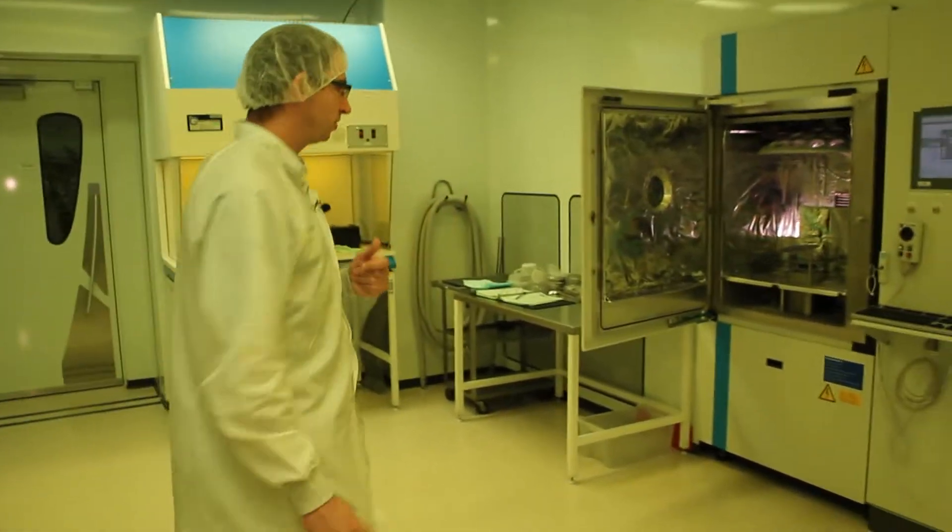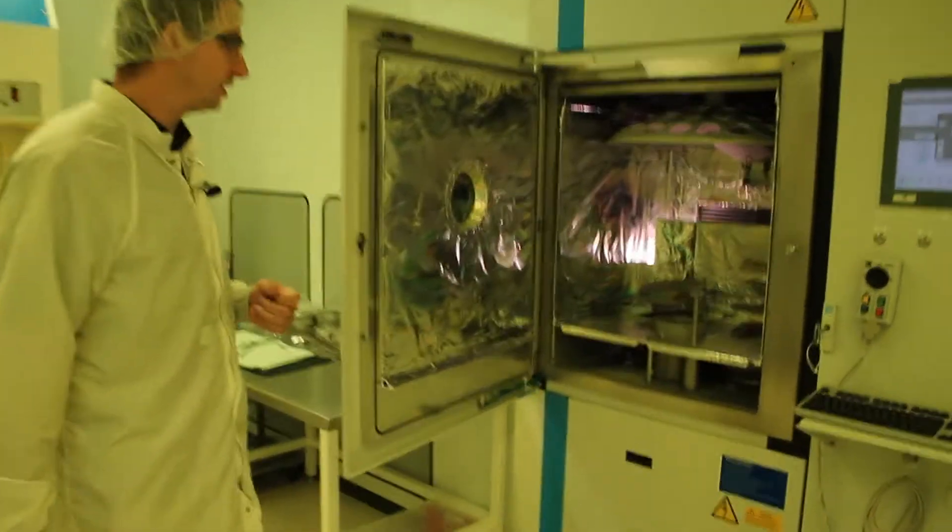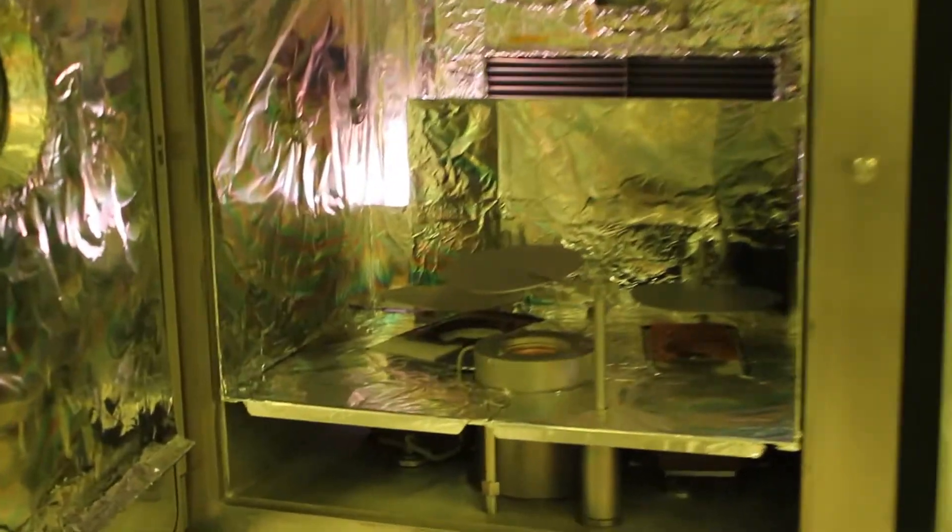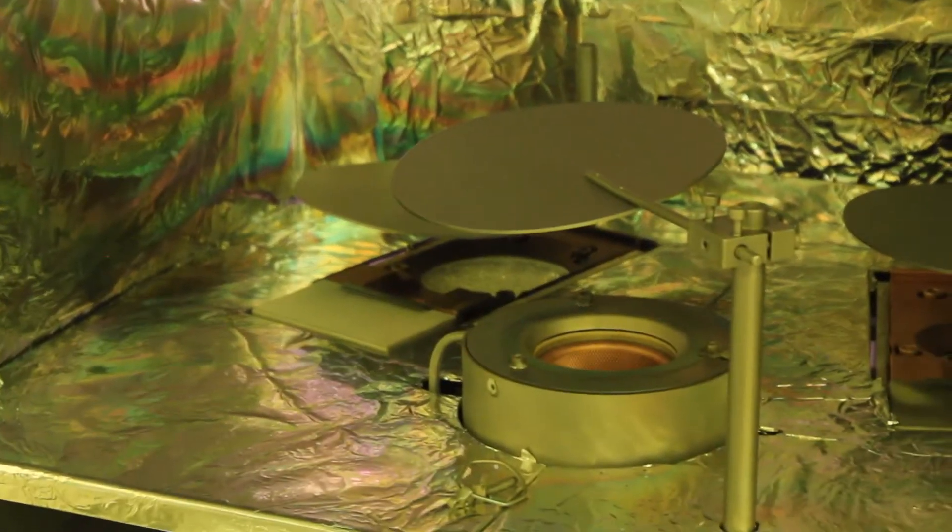Let's move on to the first one. This is a German-made system. It's labeled Cirrus Pro. It functions under the process of electron beam physical vapor deposition.